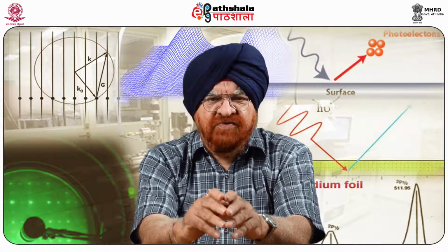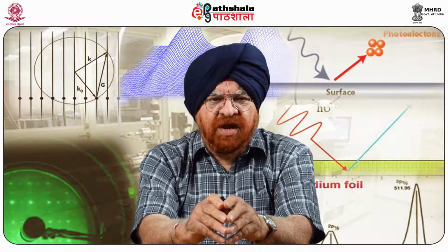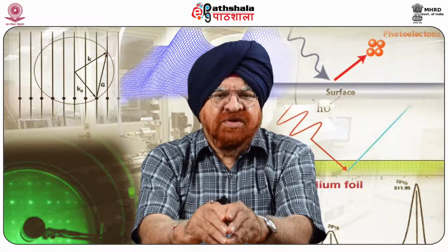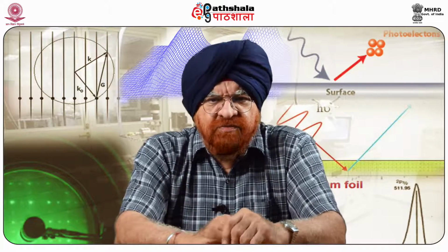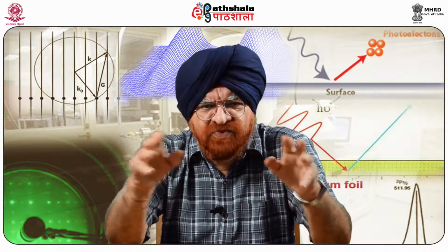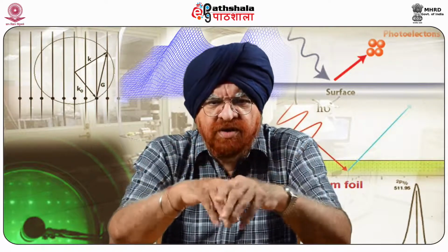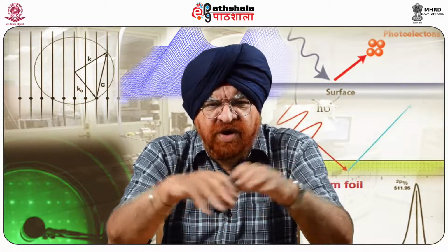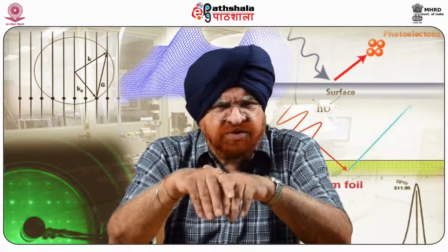Intermolecular forces affect a variety of problems in condensed phases, extending from capillarity and lubrication at the macroscopic length scale, or micelles and membrane self-assembly on the microscopic scale, to molecular recognition and protein folding at the nanoscale, which is a very important area. Understanding these phenomena, regardless of the length scale, requires a detailed knowledge of the magnitude and range of molecular forces.